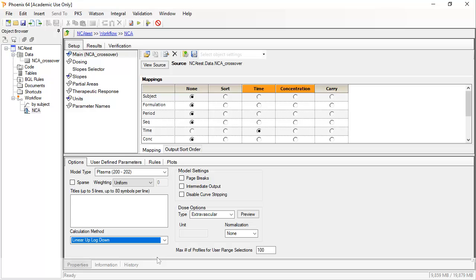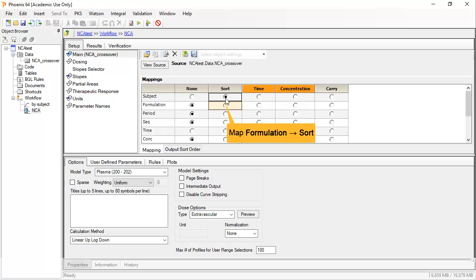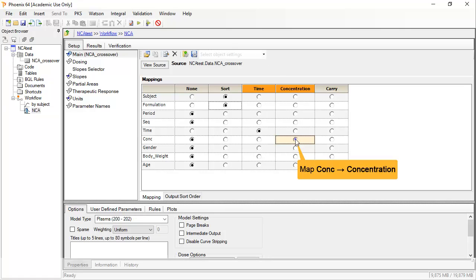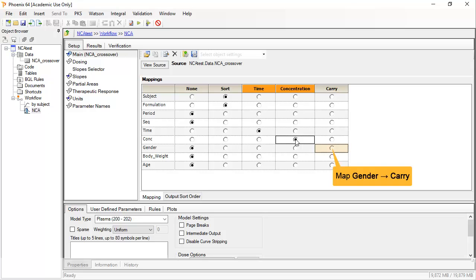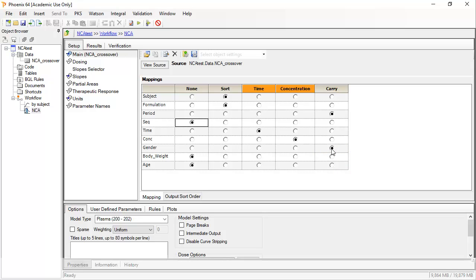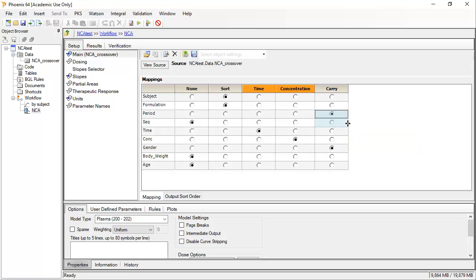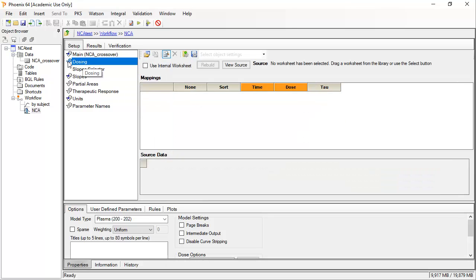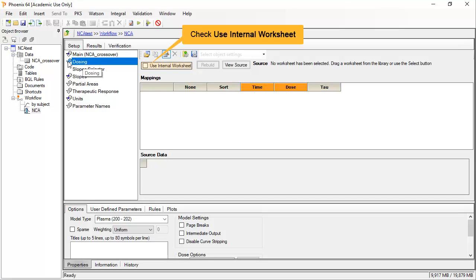Since this is a crossover study, we must map both Subject and Formulation as sort variables to identify each profile. Generally, Phoenix indicates mandatory inputs in orange. Note that Time is already mapped because the names match, and we can map Conc to Concentration. If other columns would be useful in the output, they can be selected as Carry. Note also that you can drag down on selections. A preview of any source worksheet can be toggled on. Now, to set up the dosing — since it was not in the imported data, we can enter it manually by selecting Use Internal Worksheet.